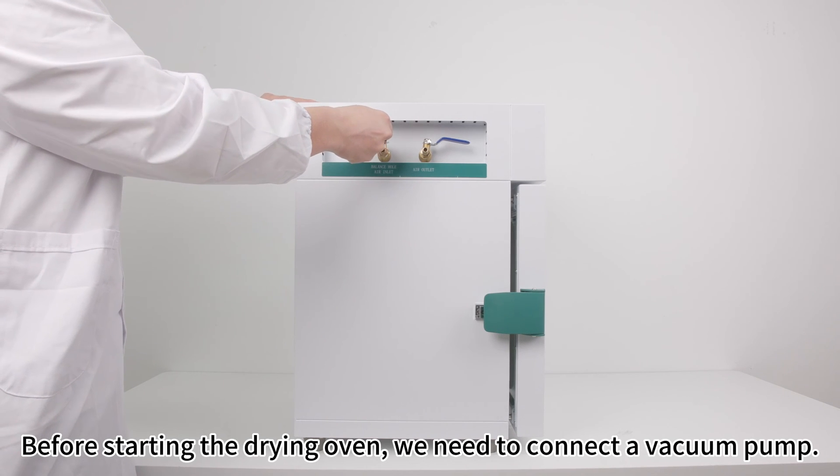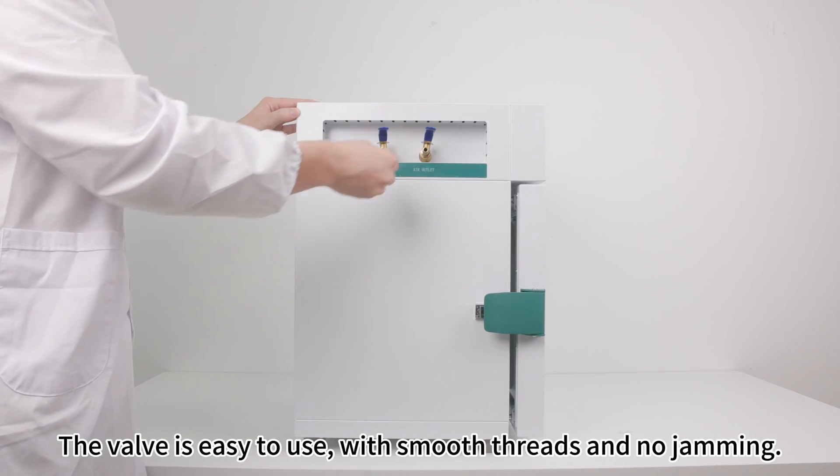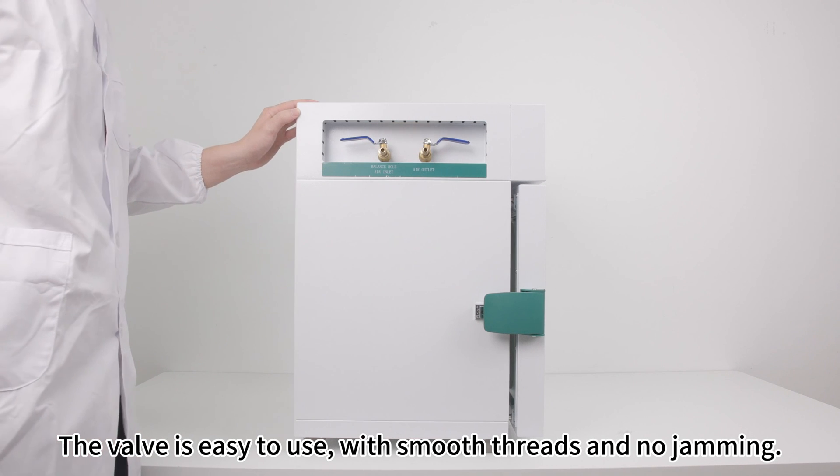Before starting the drying oven, we need to connect a vacuum pump. The valve is easy to use, with smooth threads and no jamming.